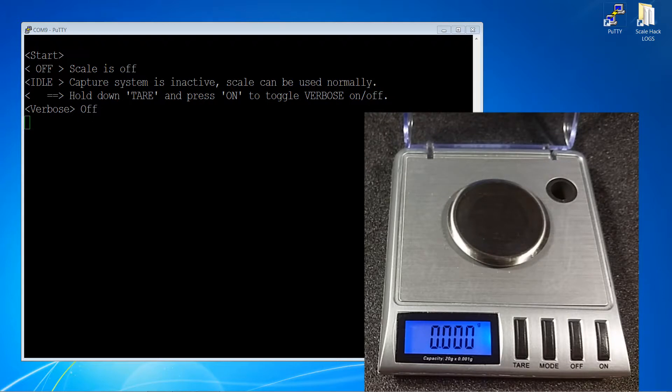Since weight change is an unreliable trigger, the mode button is used in a carefully timed sequence to ensure the scale does not turn off during logging.